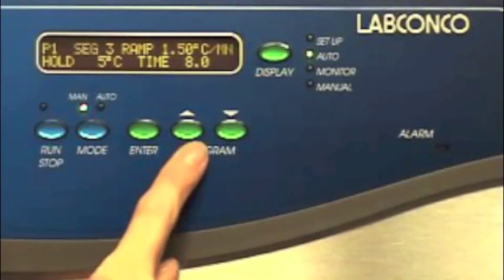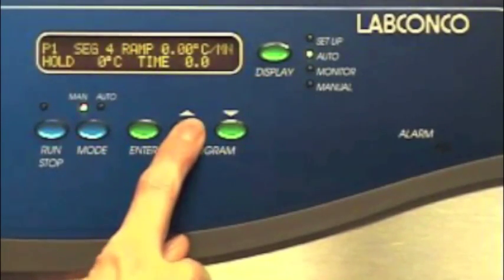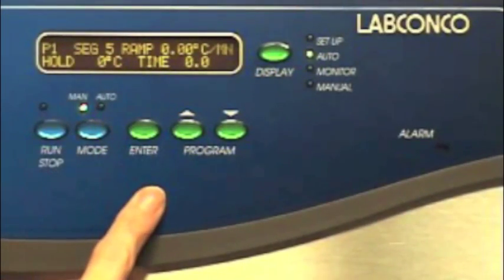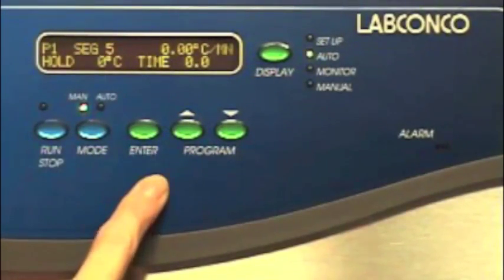Bring up segments 4 and 5, and enter 0 hours for time.